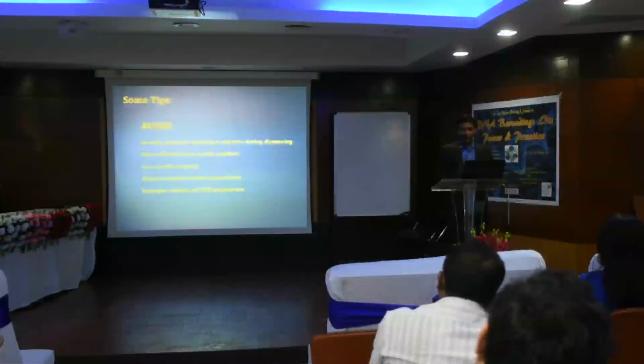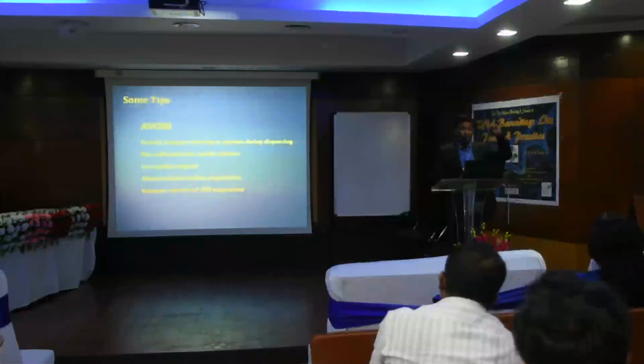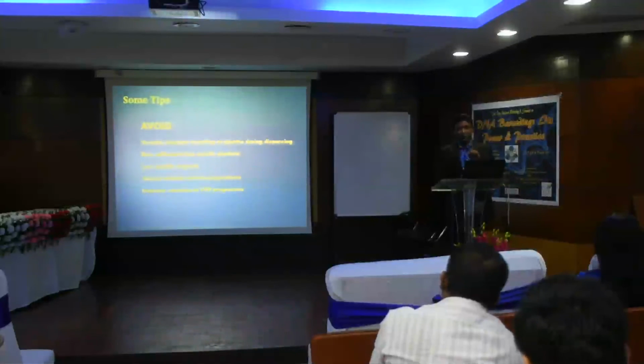In the evening also, he left, she left, and then you feel, oh, I should go. And then in a rush you will do something, then tell someone that my PCR is there, just switch off the machine. He never does. And the PCR machine will stay at 4 degrees for the whole night. So it will be the biggest source of spoilage. Once a PCR machine goes down, no PCR machine can be repaired for less than 1.5 lakh rupees. I will tell you, this is the biggest commercial policy of all PCR companies.